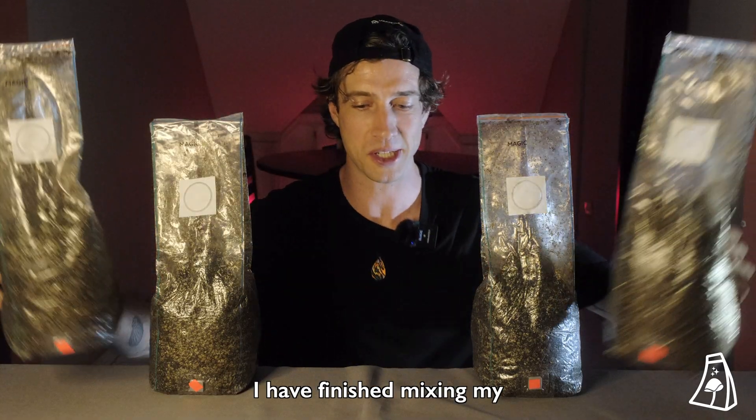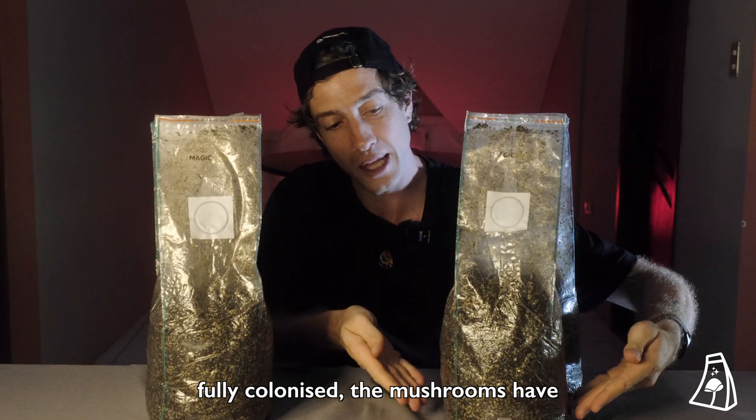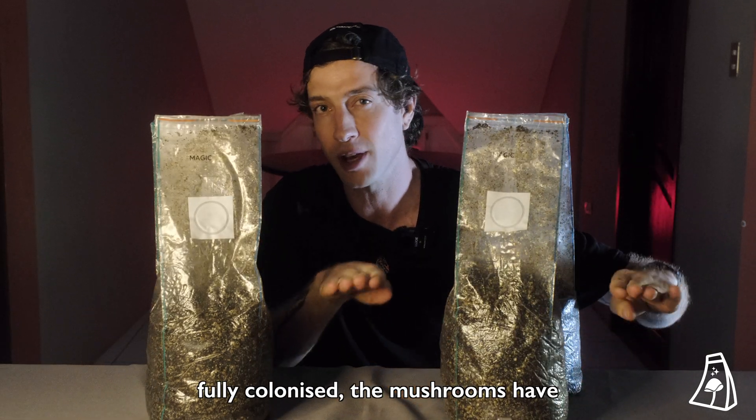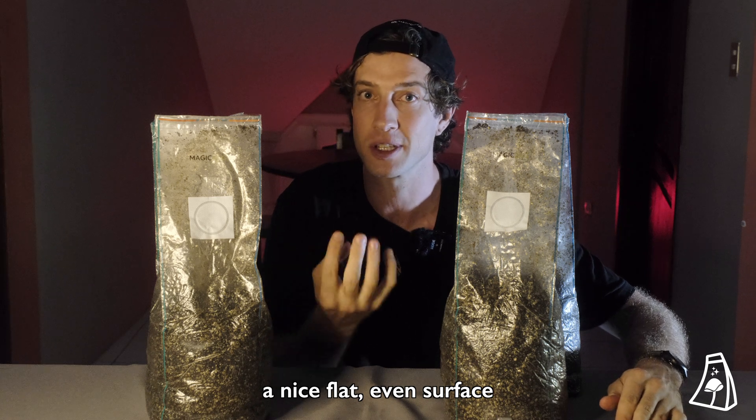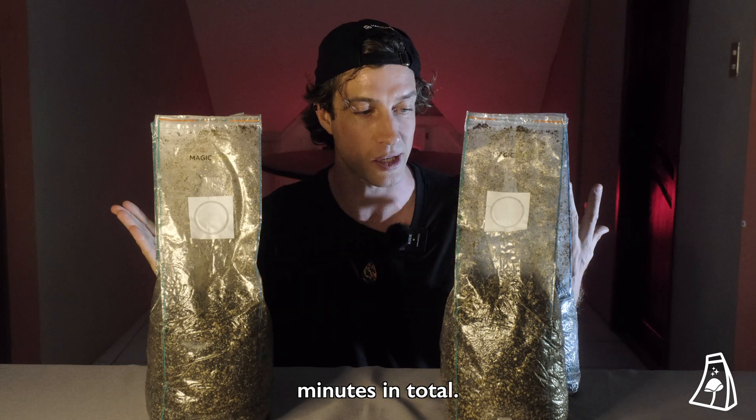I have finished mixing my bags. I've made them all into nice, even shapes so that when the bag is fully colonized, the mushrooms have a nice, flat, even surface to sprout from. I probably spent five minutes mixing each bag, so 20 minutes in total.